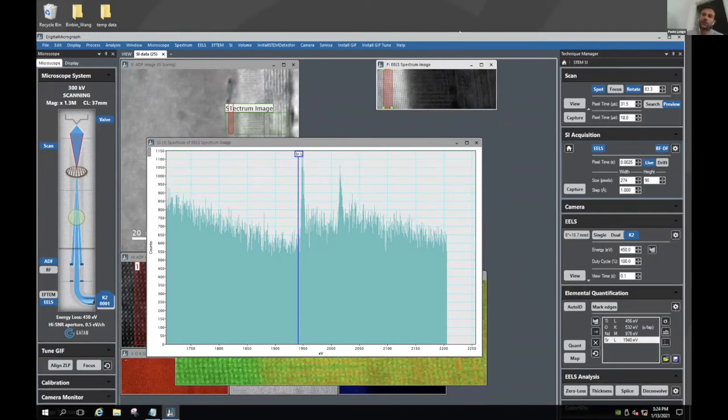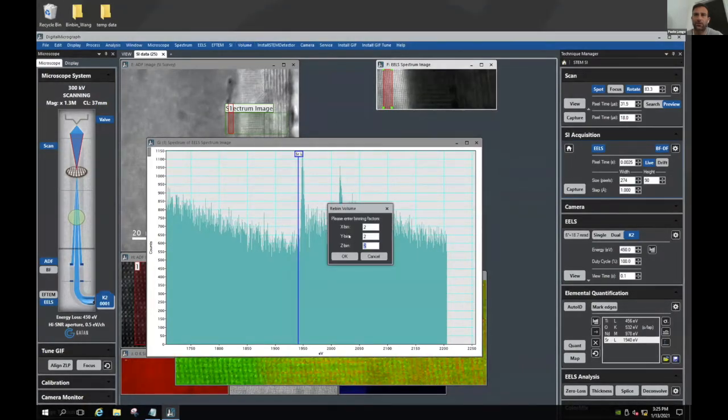Actually, this is leading to one of the questions that I was asked, how to reduce the dataset size. You can play this trick. So you go on volume and you rebin this dataset. So now you have three dimensions, X and Y, and you want to keep the same resolution, but you can bin on the energy axis. So we go from like 4,000 pixels down to 2,000 pixels.